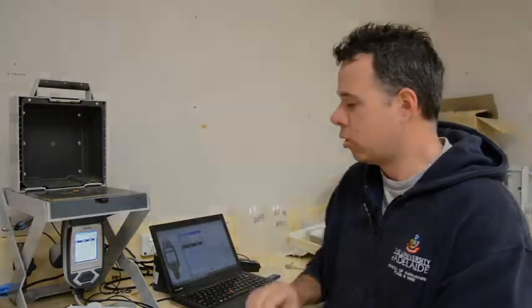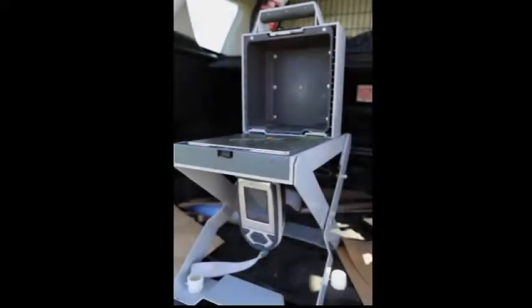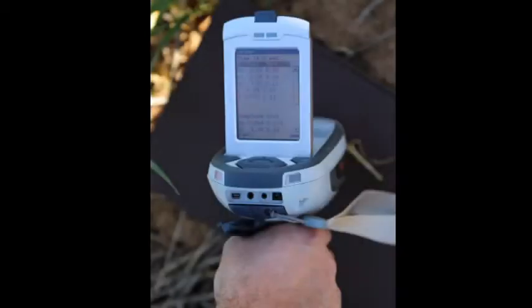So the next step, once we had those calibration sets, was to go out in the field. We had another associated project with SAGIT looking at phosphorus responses in wheat and barley, so we were able to tag along with those field trials and take this out in the field and see if we can get an accurate determination in field while the plant's growing. So we did that in the field.